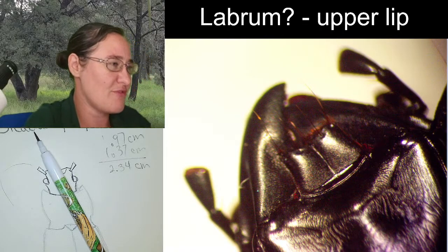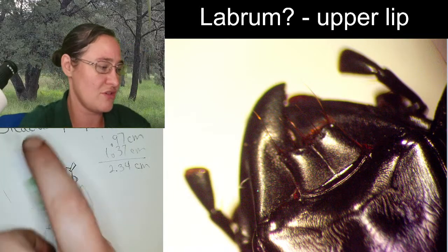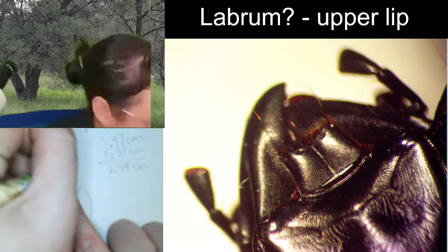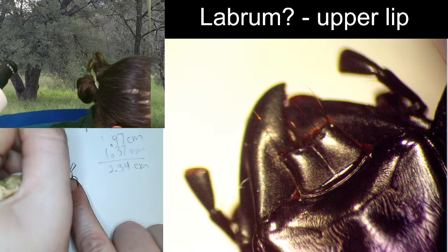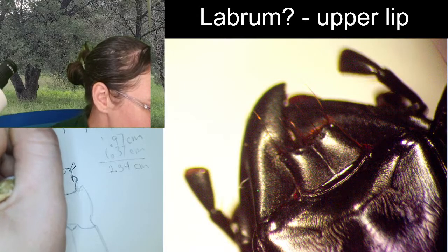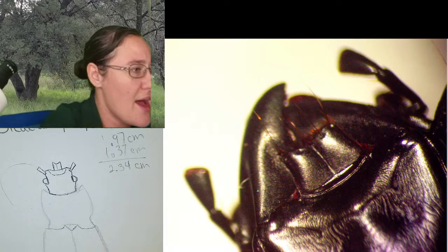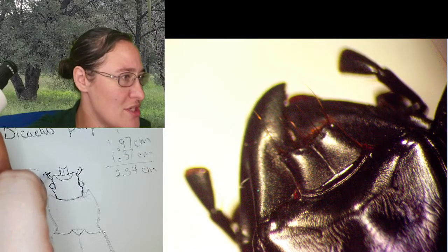And then before the labrum is the clypeus. That is the region that the labrum connects to. So I would say that this segment here would be the clypeus, and then this one here that kind of comes up, it is almost too segmented, but this is just a fold in the center, and it has this notch. I would say that is why they are called the notch-mouthed ground beetles. We also have mandibles.